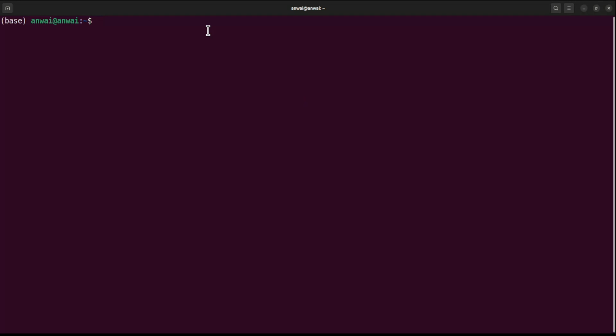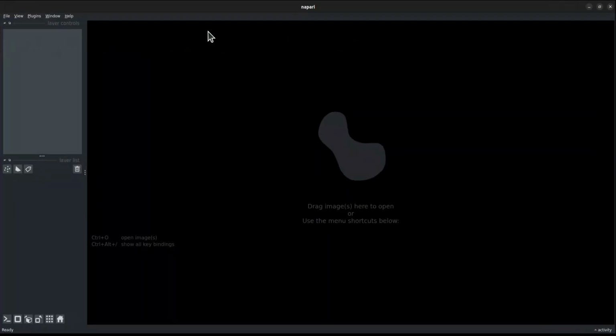Okay, so the first thing we do is activate our pre-installed environment. If you haven't watched the video of installation, we highly recommend watching our quick start video. Then we go ahead and open Napari. And there we go. We have our GUI interface activated over here.